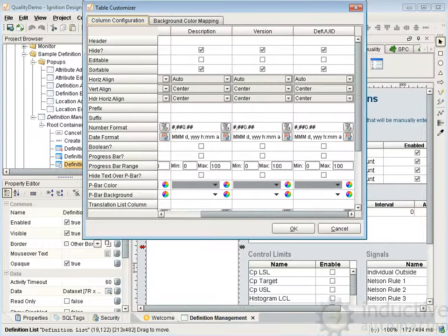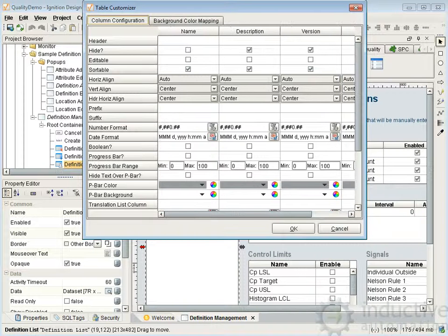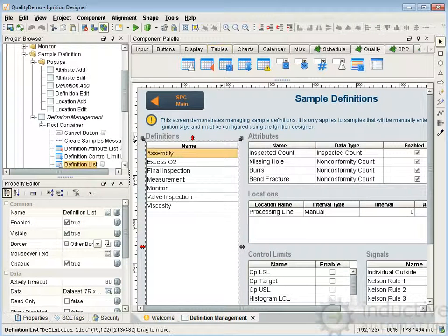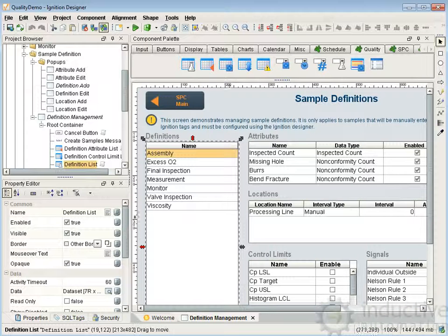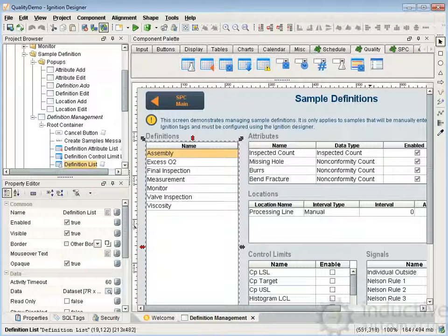In the demo you can take a look at what's selected and what to show, but if you put a new component down on the screen you will have to go in and hide some of the columns. These components work together, so as I make selections here these will automatically update. If I click viscosity, the attributes for viscosity will show here, same with the locations, control limits, and signals. You don't have to do any coding, any binding, anything to get those to work — you just put them on the same screen and at the same level. They all have to be at the same level.